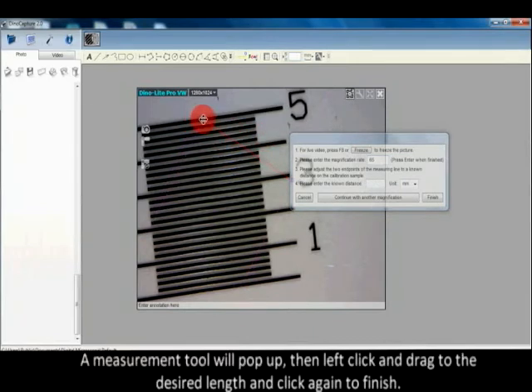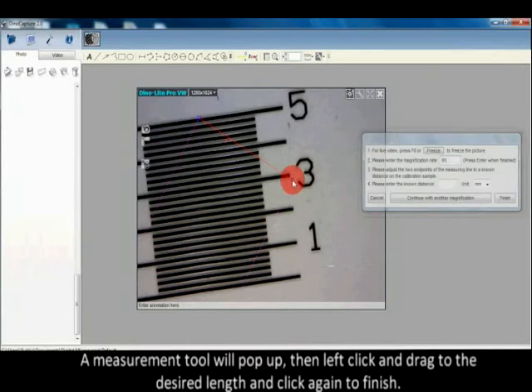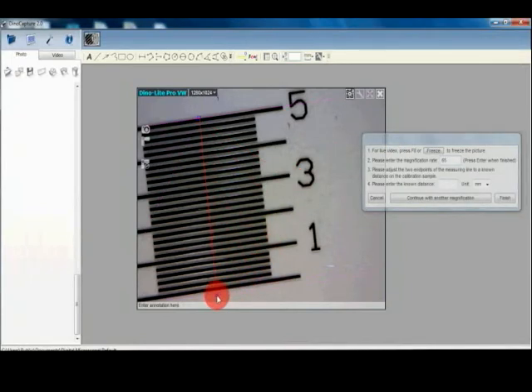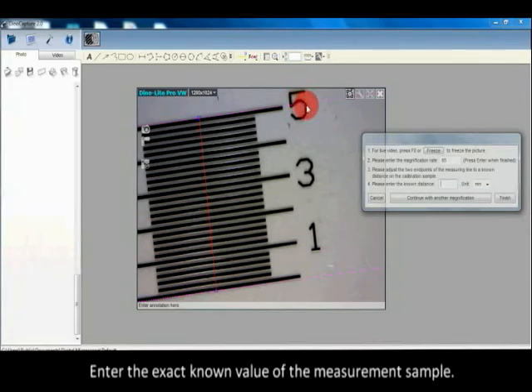A measurement tool will pop up. Then left-click and drag to the desired length and click again to finish. Enter the exact known value of the measurement sample.